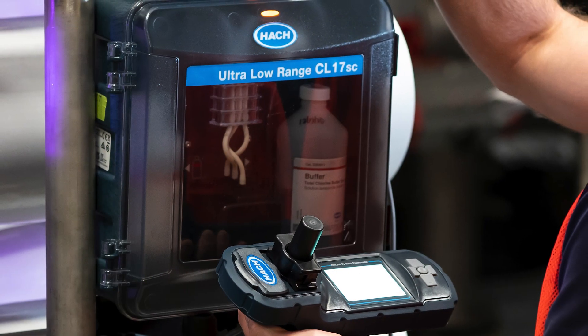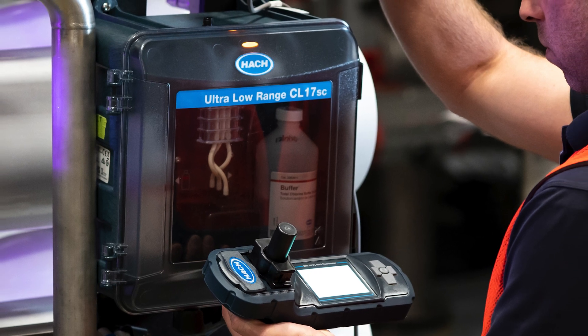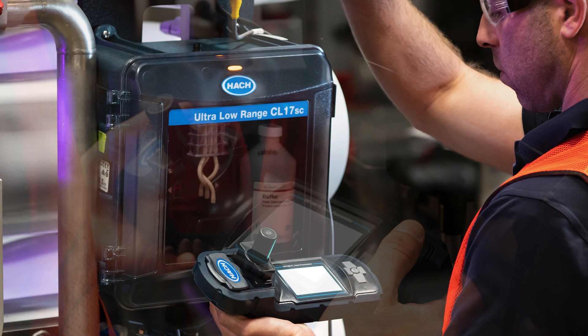With the new ULR-CL17SC online total chlorine analyzer, which has been designed to read total chlorine at ultra-low range levels, validating or verifying that it's functioning properly might be difficult because ultra-low range testing in a lab can be challenging.